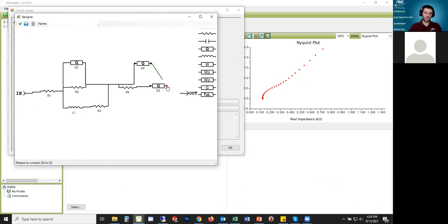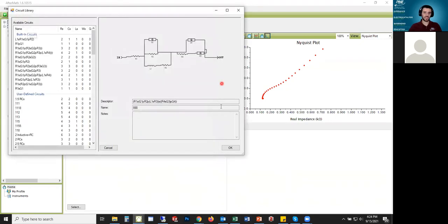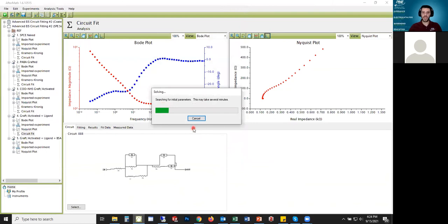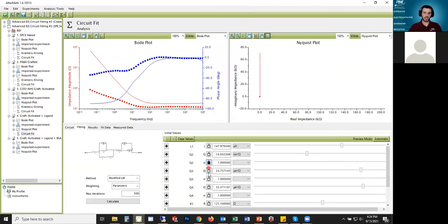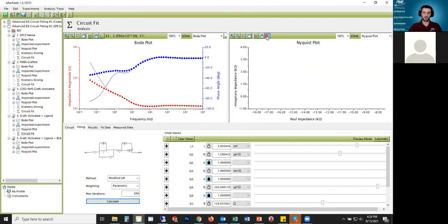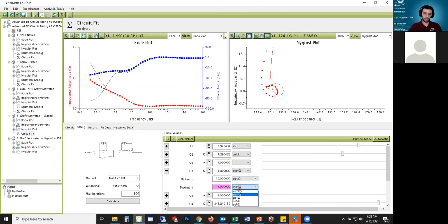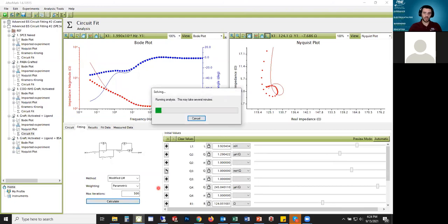And now what you'll find possibly when you do this fitting in software is that sometimes that loop can be kind of hard to fit. It doesn't always, software doesn't always do the best job at that. I'm going to see if my normal fitting alpha here will get a decent fit on that loop. And right away you can see, let's see if it got it. So it does seem to have captured that loop which is quite fortunate. It's not always the case where the loop will show up right away, so that's really pretty nice that the software was able to get that.